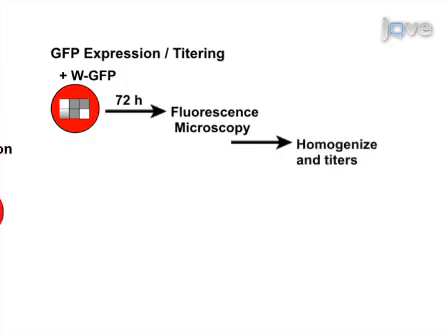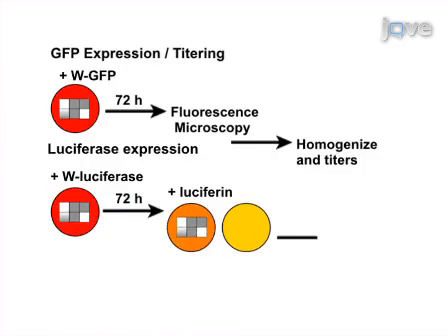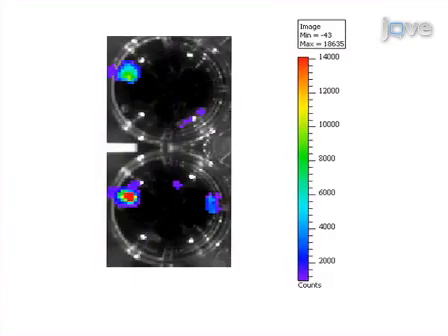Next, viral transgene expression is monitored and viral titers are determined in order to assess whether the live surgical specimen can support productive vaccinia infection. Results are obtained that show vaccinia replication in tissues based on the observation of fluorescent protein or bioluminescence reporter expression and increased viral titer over time.